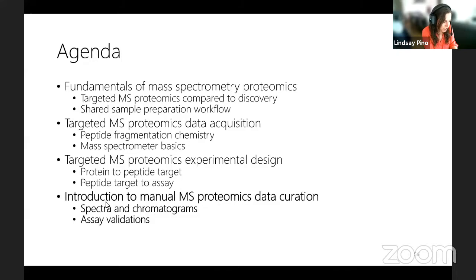How long would you suggest the wash step be relative to the column size and other related parameters? This is completely a function of the column. So you should wash about 1 bed length worth of column. And you can calculate the bed length based on just the area, the volume of a cylinder, and then the flow rate of your liquid chromatography, and try to shoot for about 1 bed length worth of wash. And I think 2 or 3 bed lengths to re-equilibrate.